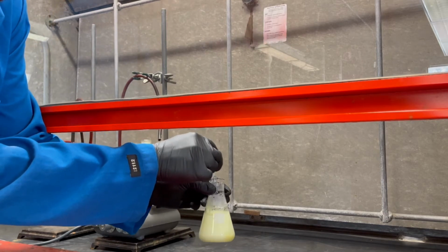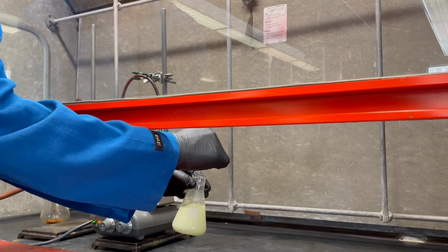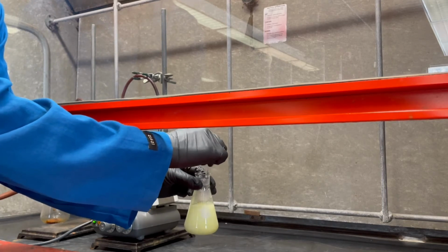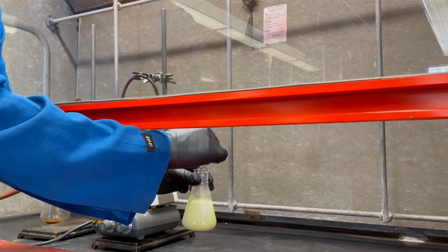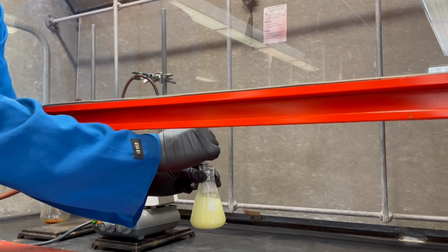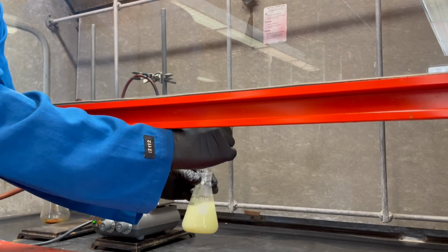You can see it's cloudy, right? So this is our solid material. And so once we stir this up pretty well, we're going to go ahead and filter it off using the Buchner funnel like last time. And then we will analyze the melting point and also the thin film IR method again with methylene chloride.